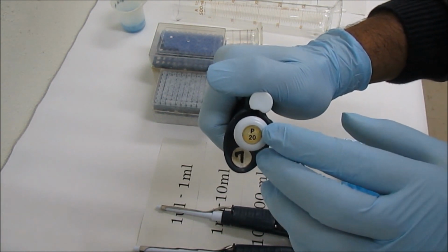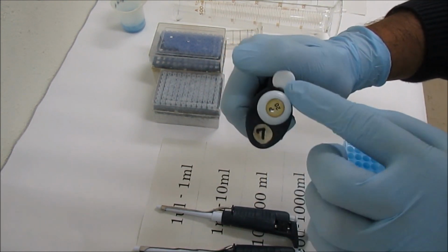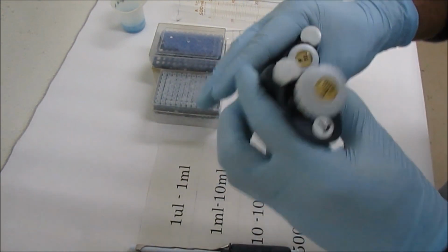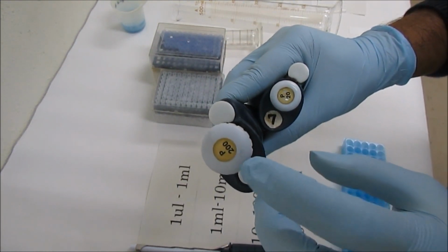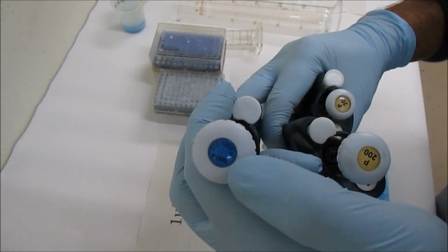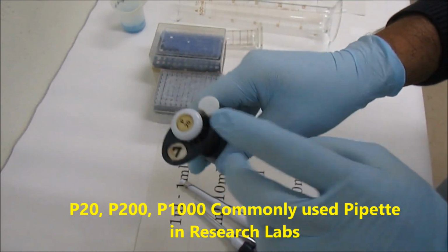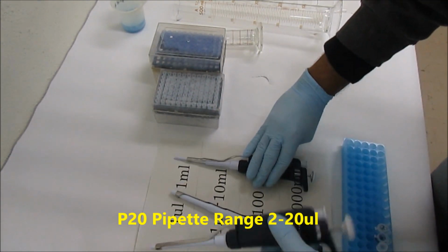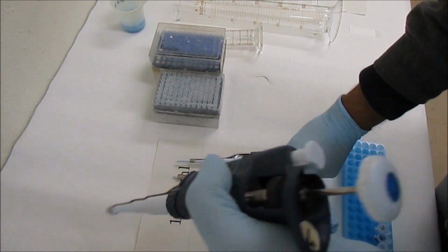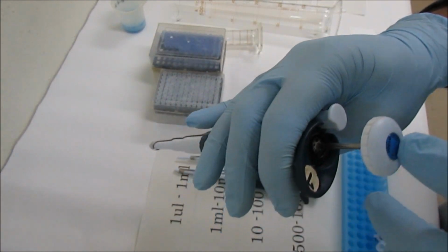Here you see the P20, right? That means you can aspirate a maximum of 20 microliters with this pipette. Here is 200, meaning you can aspirate a maximum of 200 microliters, and here is 1000, which means you can aspirate 1000 microliters. So this range is from 2 microliters to 20 microliters, this range is from 20 microliters to 200 microliters, and this range is from 200 microliters to 1000 microliters, right?